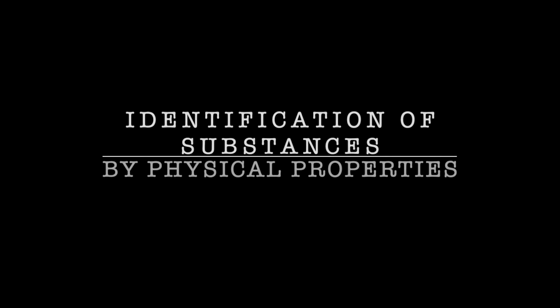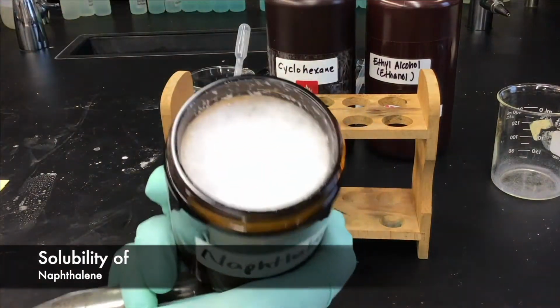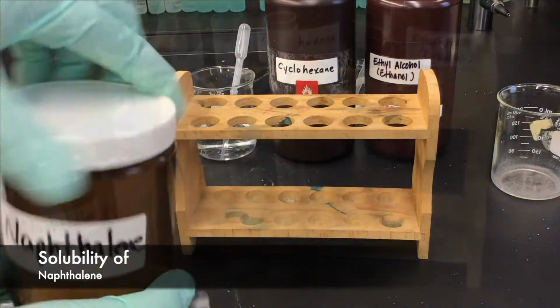This is a demonstration of the identification of substances by physical properties. In Part A, we're going to be looking at solubility. Our first solubility test will be of naphthalene. Naphthalene is also known as mothballs.